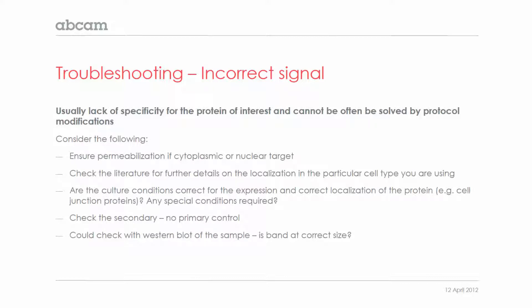The next problem is if you have an incorrect signal. This is the most difficult one to troubleshoot because it usually shows a lack of specificity for the protein of interest. It can't always be solved by protocol modifications, however there are some things to consider. Ensure permeabilization if it's a cytoplasmic or nuclear target. Check the literature for further details on the localisation in that particular cell type you're using, and check if the culture conditions are correct for the expression and correct localisation of the protein.